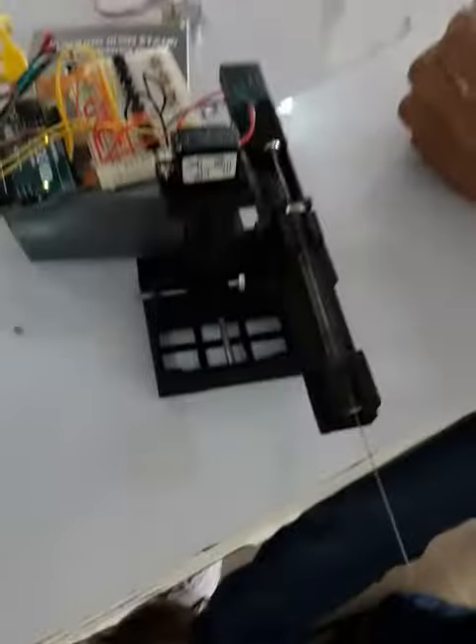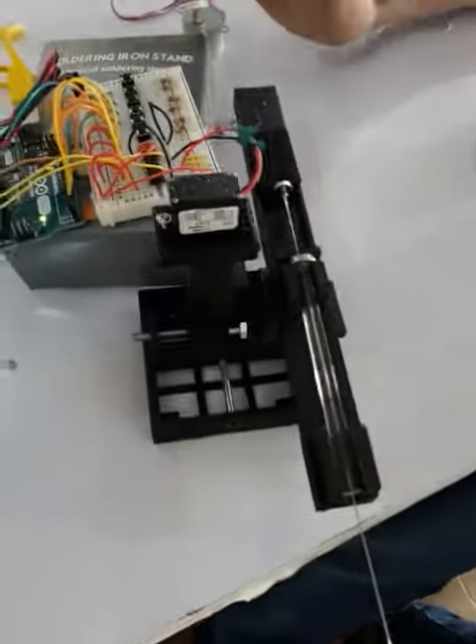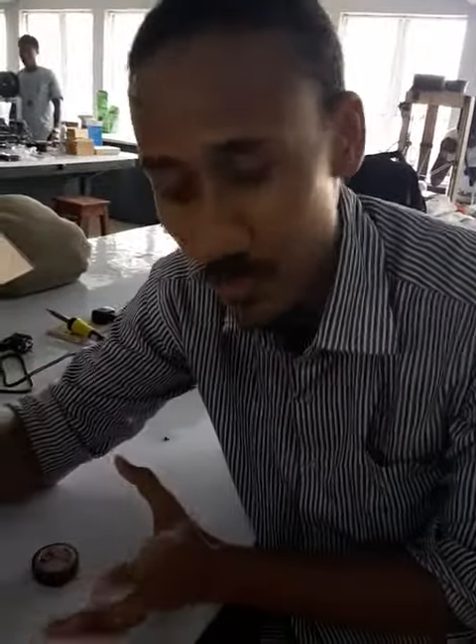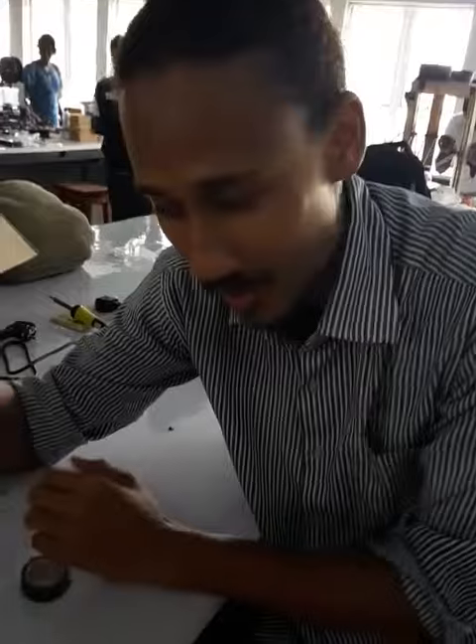So we want to design a very cheap system of doing this, and we had the idea of combining a micromanipulator and a syringe pump. For now we've only been able to move the Z-axis, but eventually we'll put three motors in to move up, down, left, right, front, back.